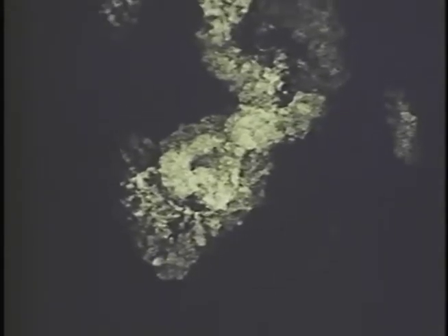Okay. Now, let me just wrap things up with a brief mention of the kinds of things we've been trying to do in the chromosome world using EM tomography. And really what we're after is trying to understand how DNA and proteins get organized into the unbelievably complex higher order levels of structure that occur in eukaryotic chromosomes. Shown here is one image out of a tomographic data set from some of the earliest work that Andrew Belmont did in the lab.